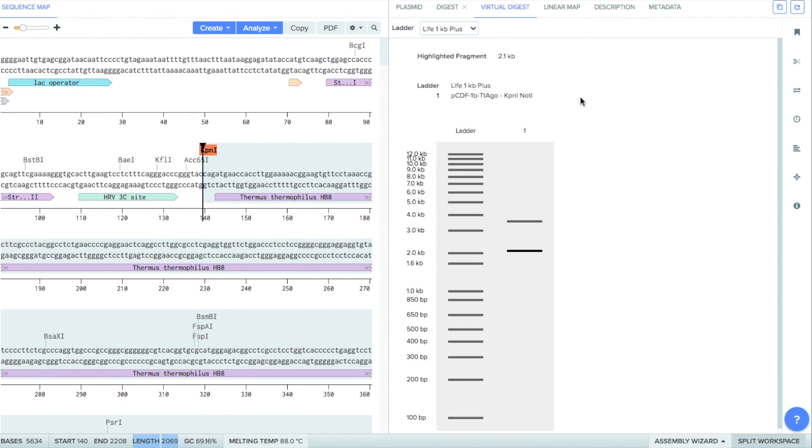Congratulations! You have successfully completed your first Virtual Digest. To learn more about agarose gels, check out the video linked above.